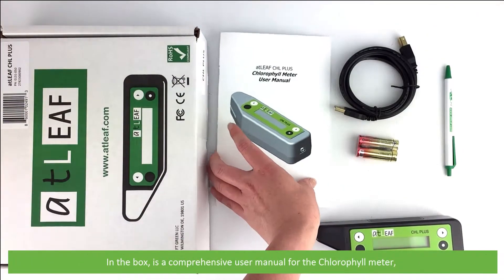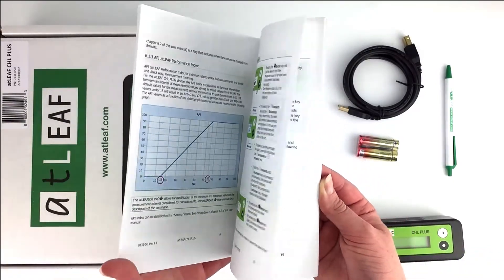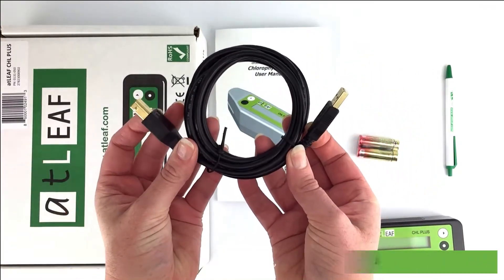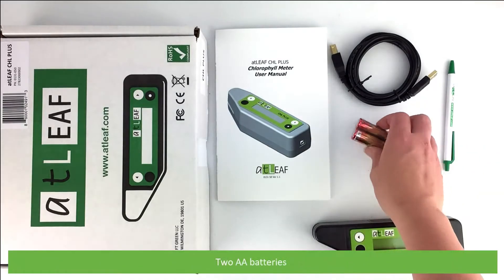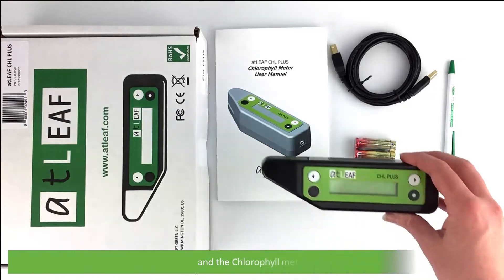In the box is a comprehensive user manual for the chlorophyll meter, a USB cable, an ATLEAF branded pen, two AA batteries, and the chlorophyll meter.